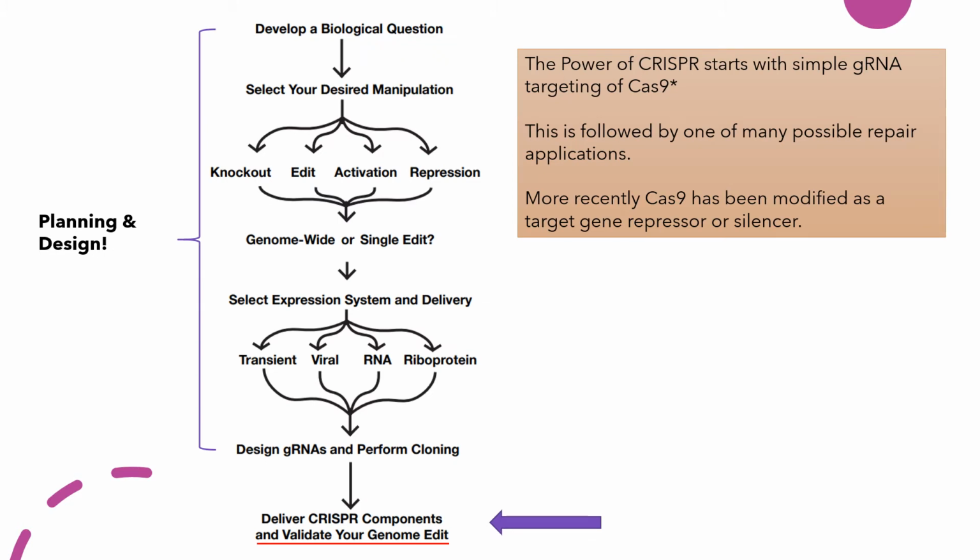So from the beginning, I've talked about the fact that CRISPR is a lot about the design. That's a huge, tremendous piece of it. Most molecular biology experiments involve a lot of design because you're dealing with sequences, which are a little bit abstract. You visualize them as letters. Ultimately, they're becoming protein products. CRISPR is very much the same way, but it involves lots more pieces that need to finally come together to work together. And this shows, this emphasizes this point. So this planning and design phase is a big piece of it. Then you put your CRISPR reagents into your system, be it mouse or E. coli, and do the CRISPRing, and that's this little guide that's done at the end. Okay?